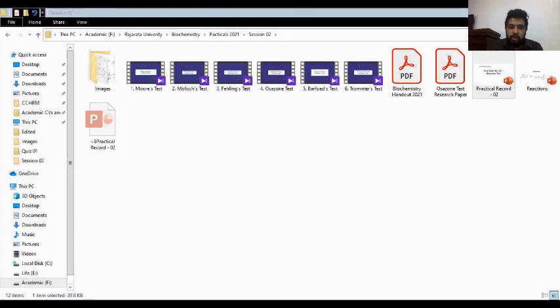We usually don't check the pH, but this reaction occurs at those specific conditions, 4.3 pH and 100 degrees Celsius. Okay, that is why we add glacial acetic acid and sodium acetate, as well as doing this test in a boiling water bath. Can we add some photographs regarding the experiment under method?